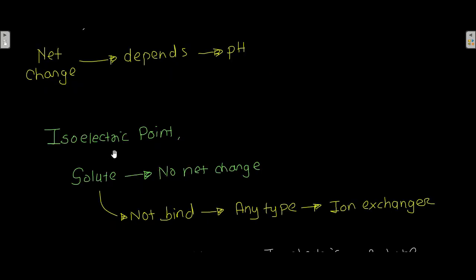Now at the isoelectric point, the solute doesn't have any net charge, and that is the reason why the solute will not bind to any type of ion exchanger.